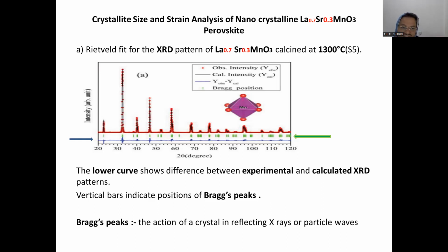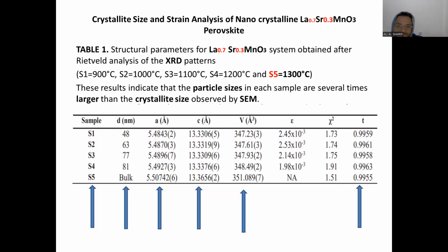What does Bragg peak mean? The action of a crystal in reflecting X-ray or particle waves.